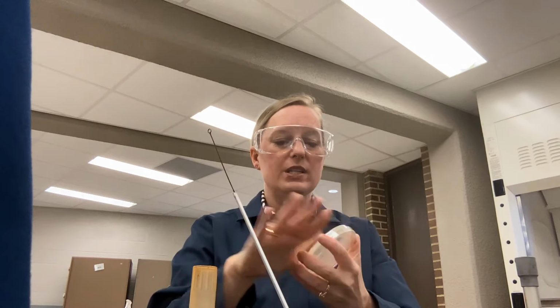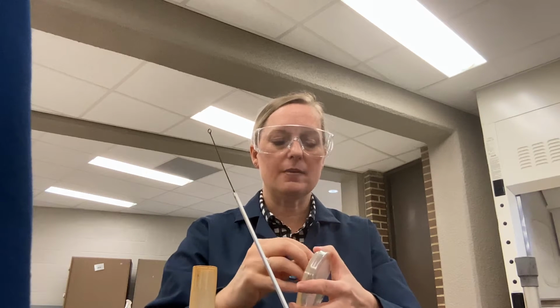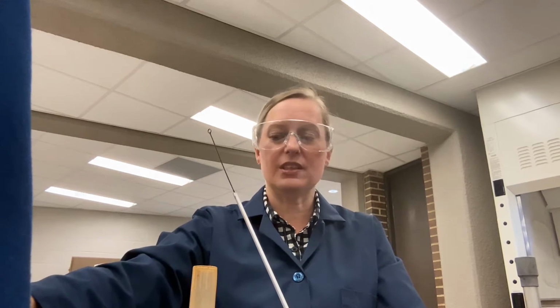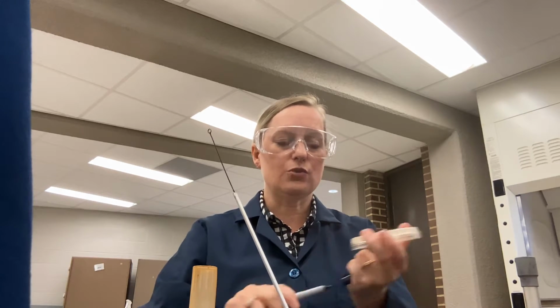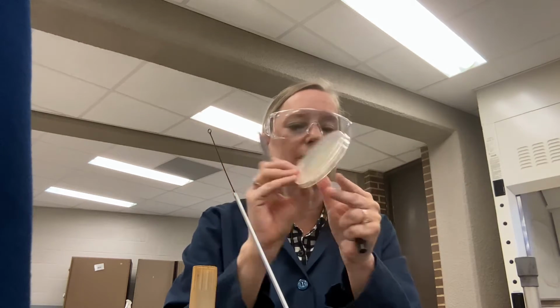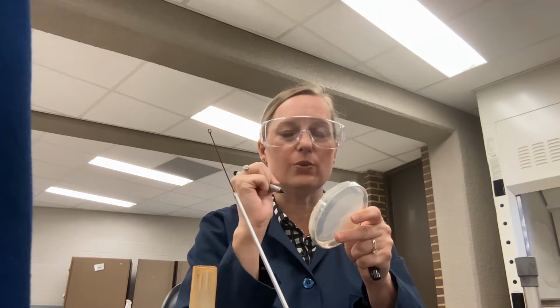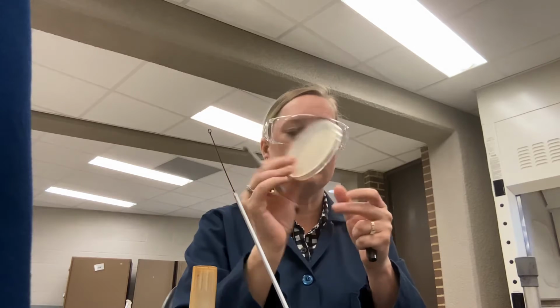So we're going to label the bottom of our plate with typically our group number, our lab section, and what is in the plate, so whether it's the different types of bacteria, things like E. coli, etc. And we're going to be doing the streak plate method. If you want to make a little grid for yourself, that's totally fine. You could put numbers like 1, 2, 3, 4, because we're going to have 4 zones. This is called the quadrant streak plate method. And if you want to do that, that would be totally fine.